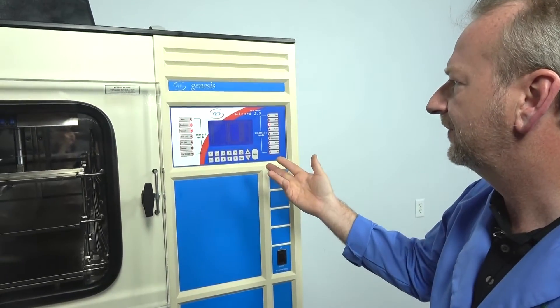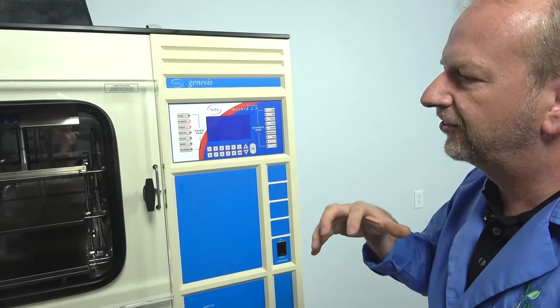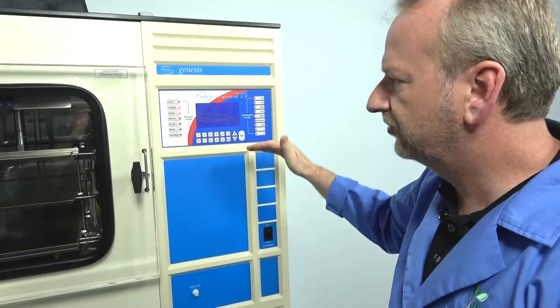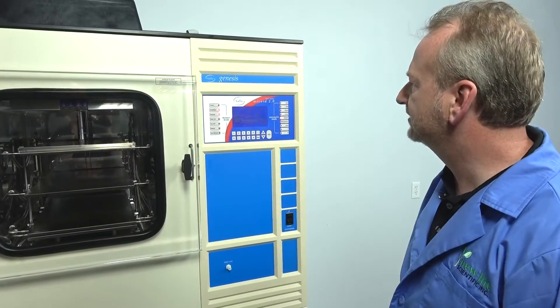It has negative 50-degree shelves, so you can freeze something down to negative 50, then slowly thaw it out and cycle through your program. You turn the condenser on and just build your recipe in the recipe builder section.